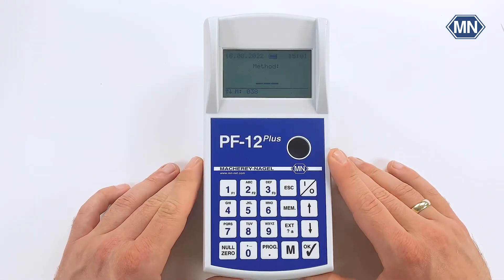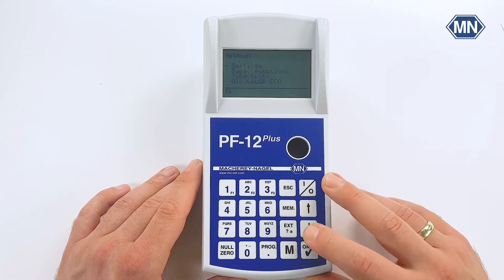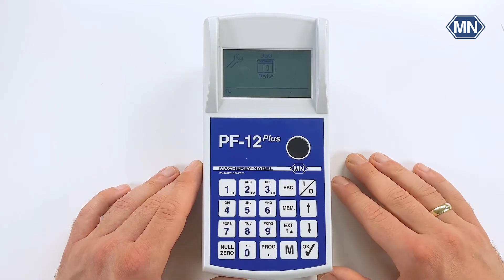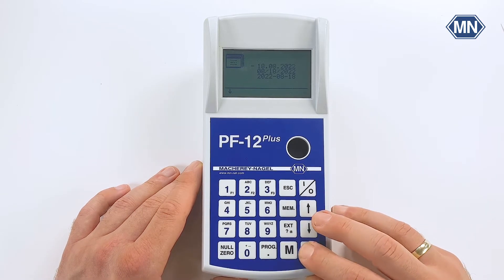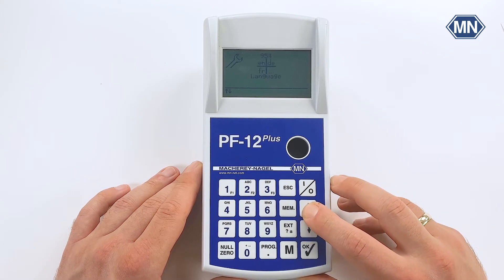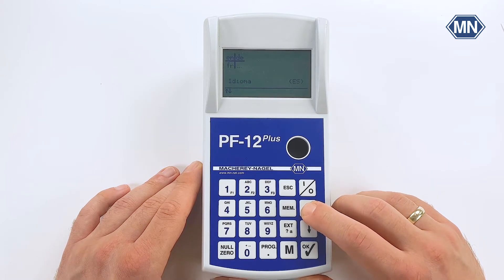After you first start the photometer you can enter the settings either by simply pressing the upwards key two times and confirm with OK, or by entering the method number 900. In the first entry you can set the date and choose between three different date formats. The next entry allows you to set the time and again you can choose between two time formats. The next important setting is the language setting, which allows you to set the language of the photometer to either of the 14 languages which are included.